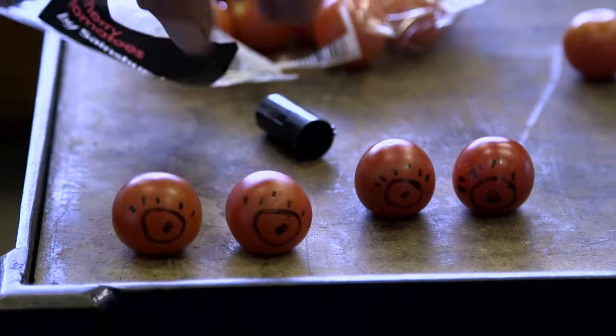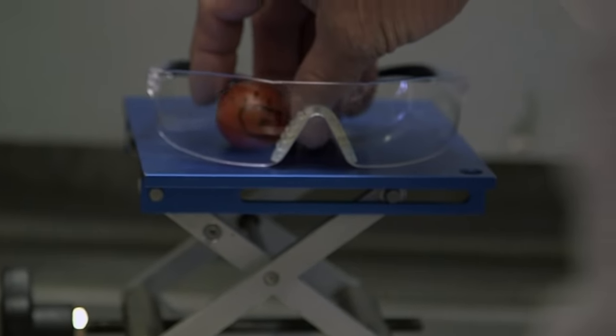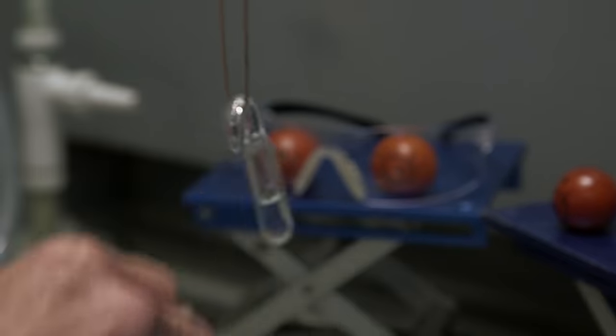We have an amazing demonstration of why safety glasses are important in the lab. It's a very simple demonstration: a sealed tube of water heated up in front of some tomatoes.